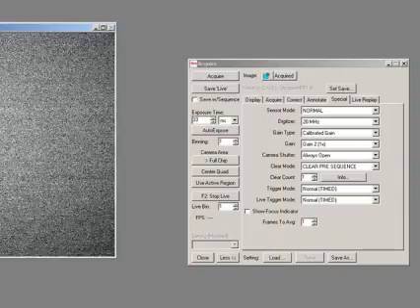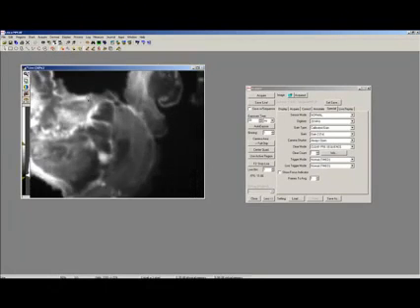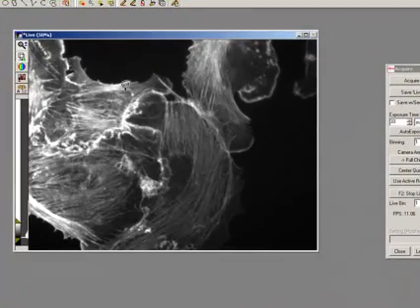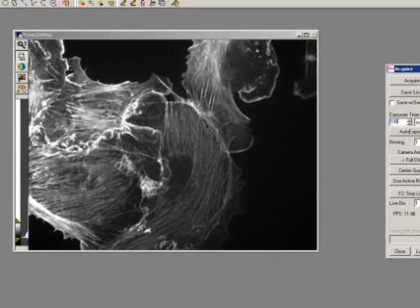Gain state 2 means 1x. So let's just start and have a look at a picture quickly. Let's just get that right. So 33 millisecond exposure time, and we can see we've got an image and we're moving it around live on the screen. We always recommend, to get the best out of these cameras in low light, to use them with best fit range and auto scale on. In most instances for fluorescence that works.